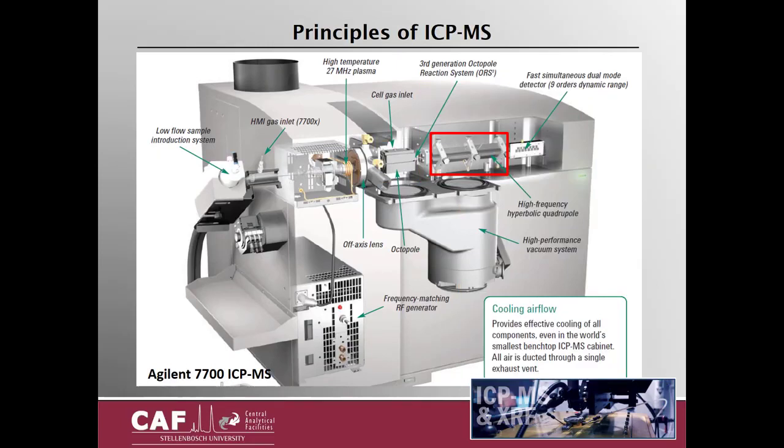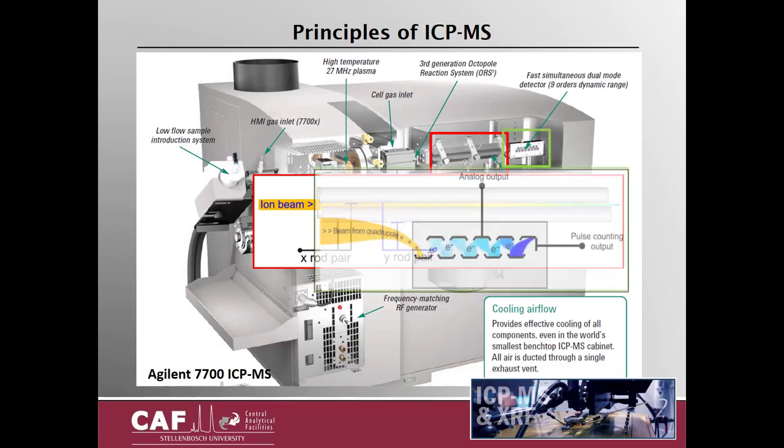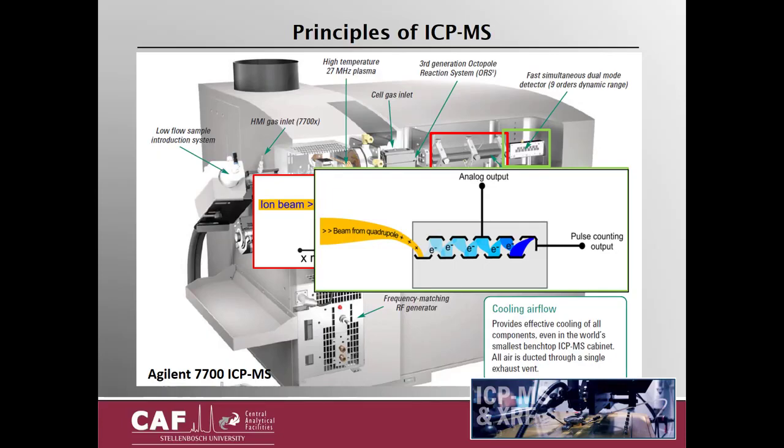After the interfering molecules have been removed in the collision cell and the analytes exit, they pass through the quadrupole mass analyzer, where different voltages are applied that stabilize only a single isotope mass at a time and pass it onto the detector. Therefore, it's a very fast sequential process, with measurement for laser ablation typically at 10 milliseconds per isotope mass.